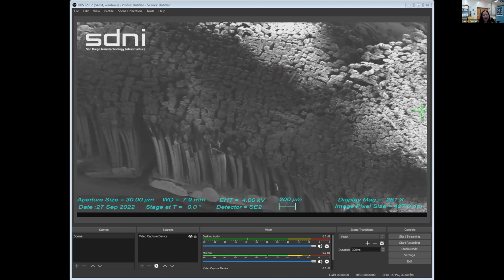Okay. And also, by the way, the white spots on the right side of the screen occur sometimes with these types of organic samples that we need to coat with metal. Oh, Zach, do you have a question? Yeah, Lauren, a question came up. How much of the gecko's foot are we looking at? What percentage of it? I'm not entirely sure, but I did take a look at the foot on the chip before I put it into the microscope, and it was like a dot. Needless to say, he's not with us anymore, right? No. I'm sure the gecko could survive after just losing this singular dot.